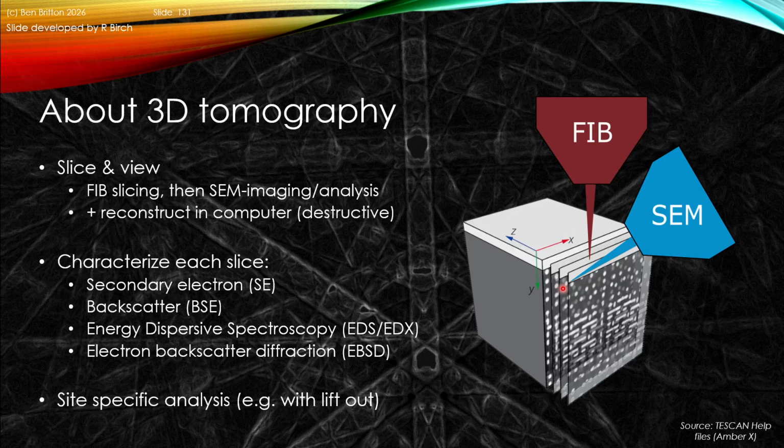And given that we just previously in the last lecture talked about site-specific methods, we can also enable this free surface to be analyzed with great precision with wide angles, and that can be done using a lift-out approach, as we'll show a bit later, which is super important in particular for EBSD methods.